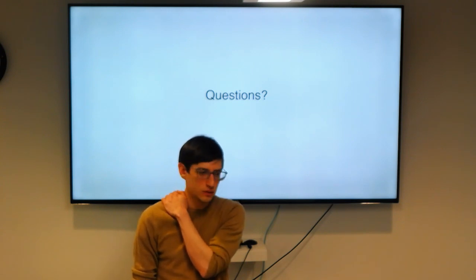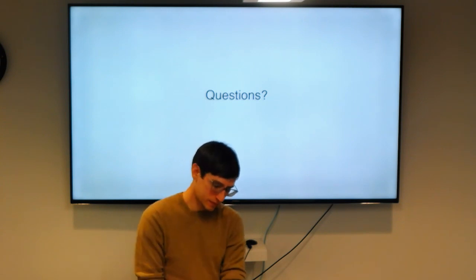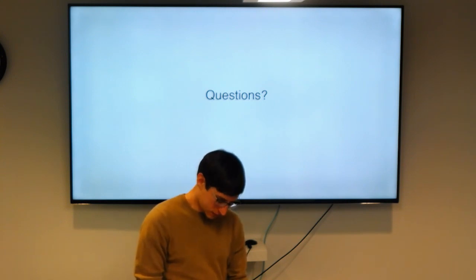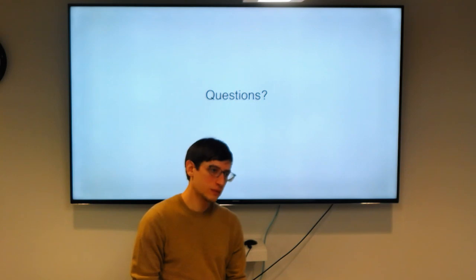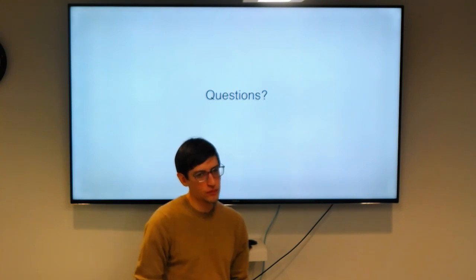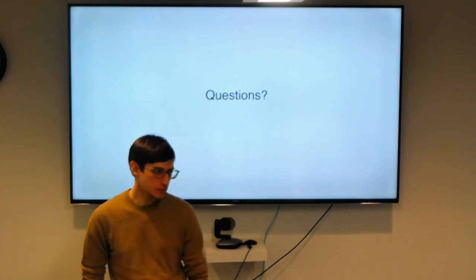I have a generic question. When you're talking about the amyloids and how there's the challenge to align them at low resolution, is there something about beta sheets themselves that have low resolution, like low contrast, versus alpha helices?